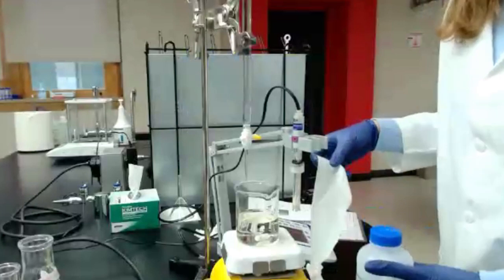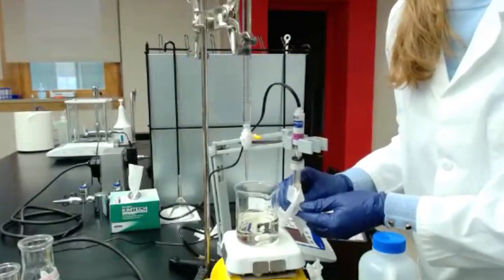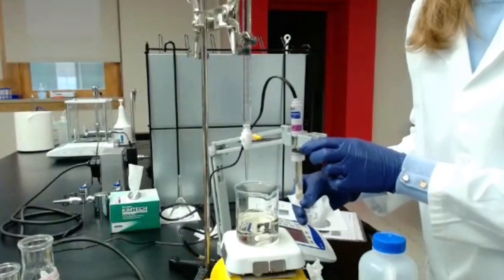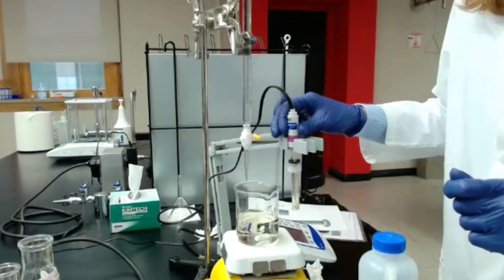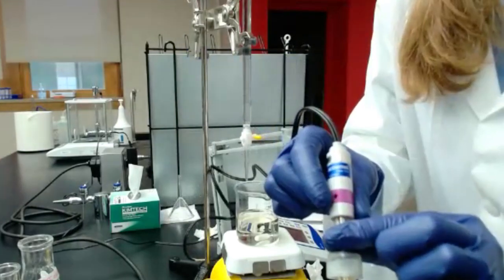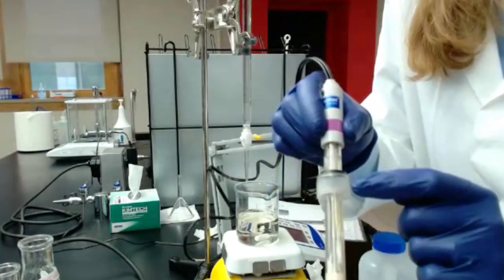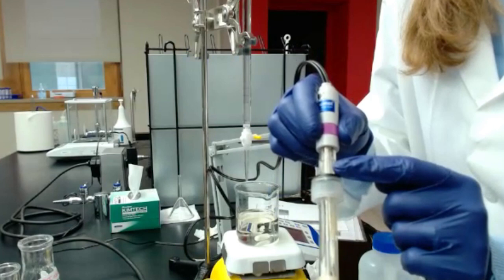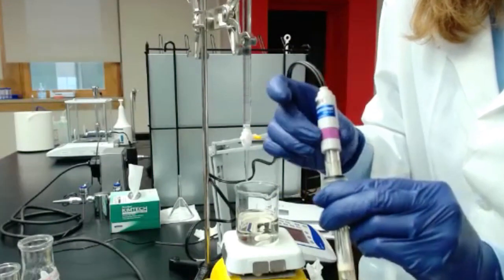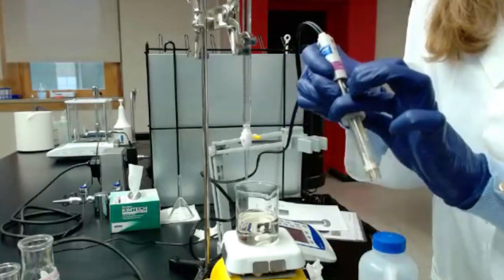After rinsing, you make sure you dry it, with a Kim wipe or a soft tissue or soft paper towel. And then you don't forget to close the hole, because if you have liquid inside or gel, it's going to dry. So make sure you close it each time when you're done, when it goes to storage. And then you can put that back down.